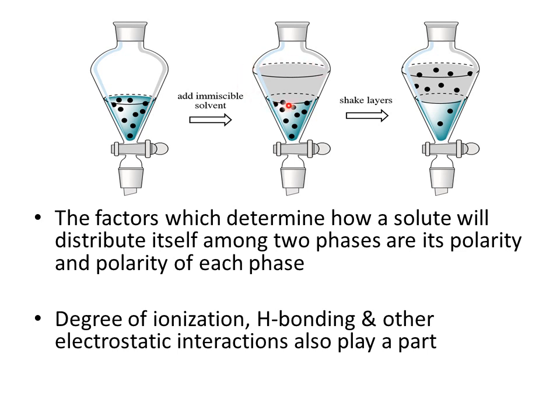You can see here is solvent B. And now after closing this separating funnel, we'll shake it. Definitely the solute will start moving from solvent A to solvent B, which can be seen clearly here in the last diagram. In the last part, you can see the solute, shown here with the black dots. They have transferred to the upper layer, to solvent B.